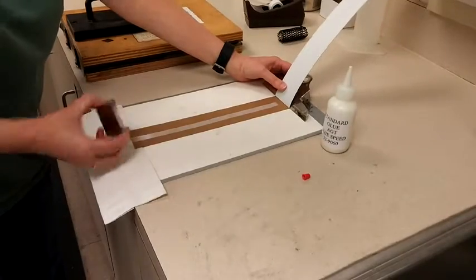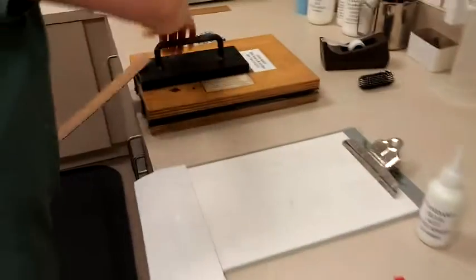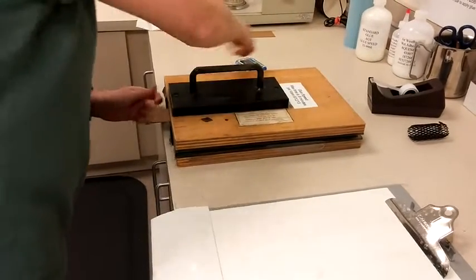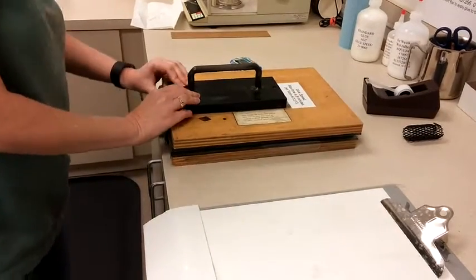The coated side is placed on top and the glued joint is compressed under a load of 12 pounds. A portion of the sample is separated manually at set time intervals and the time required to achieve fiber tear is reported.